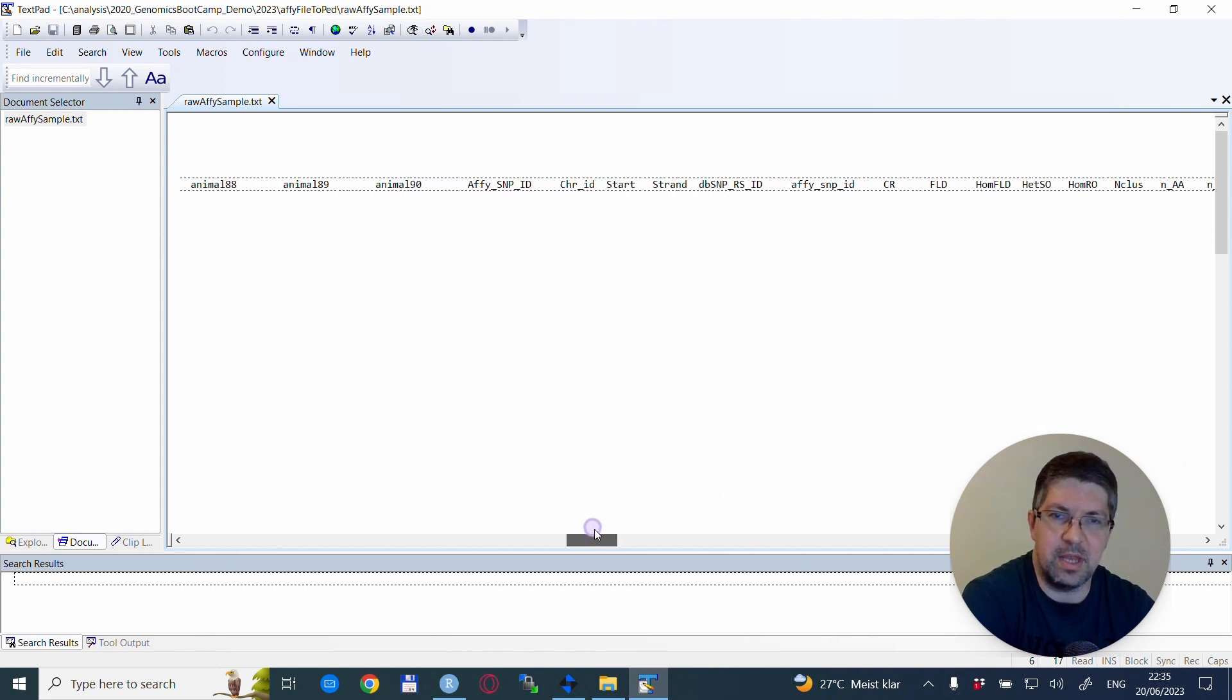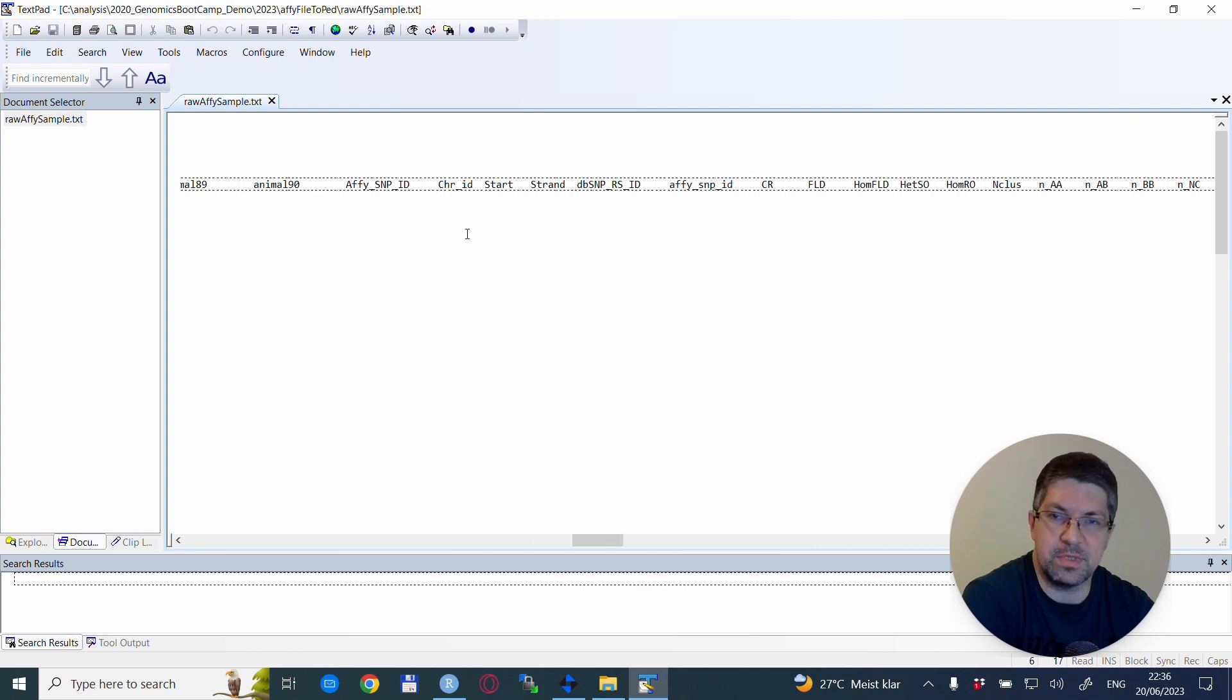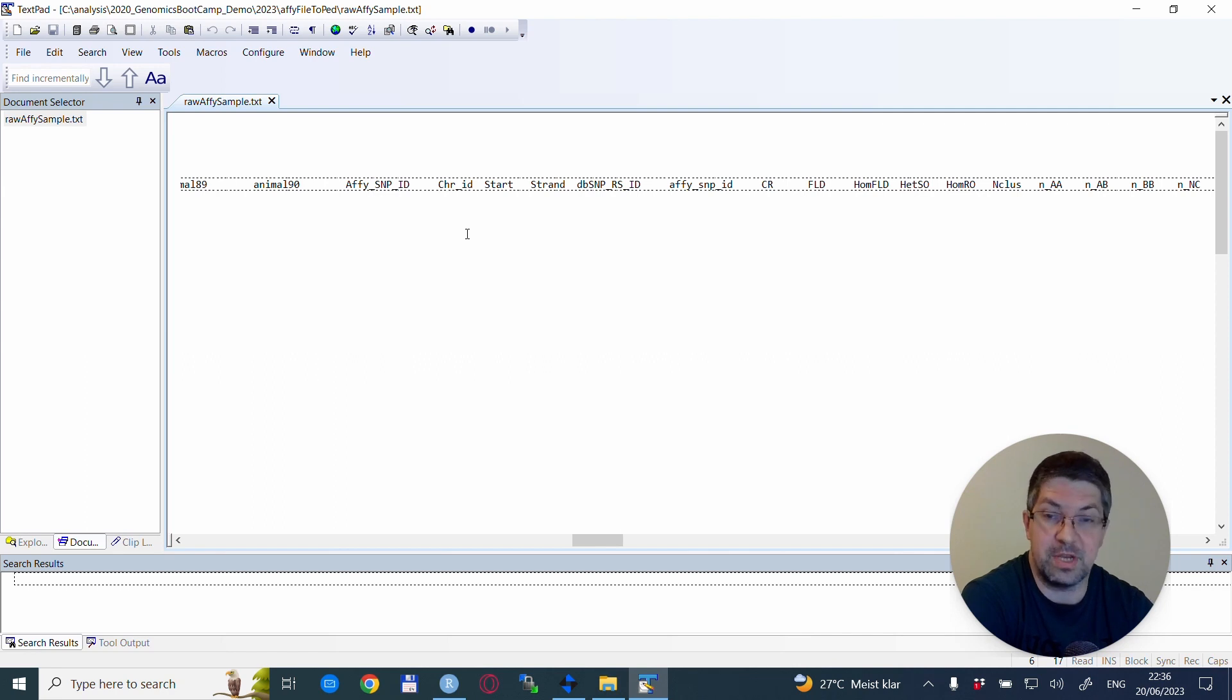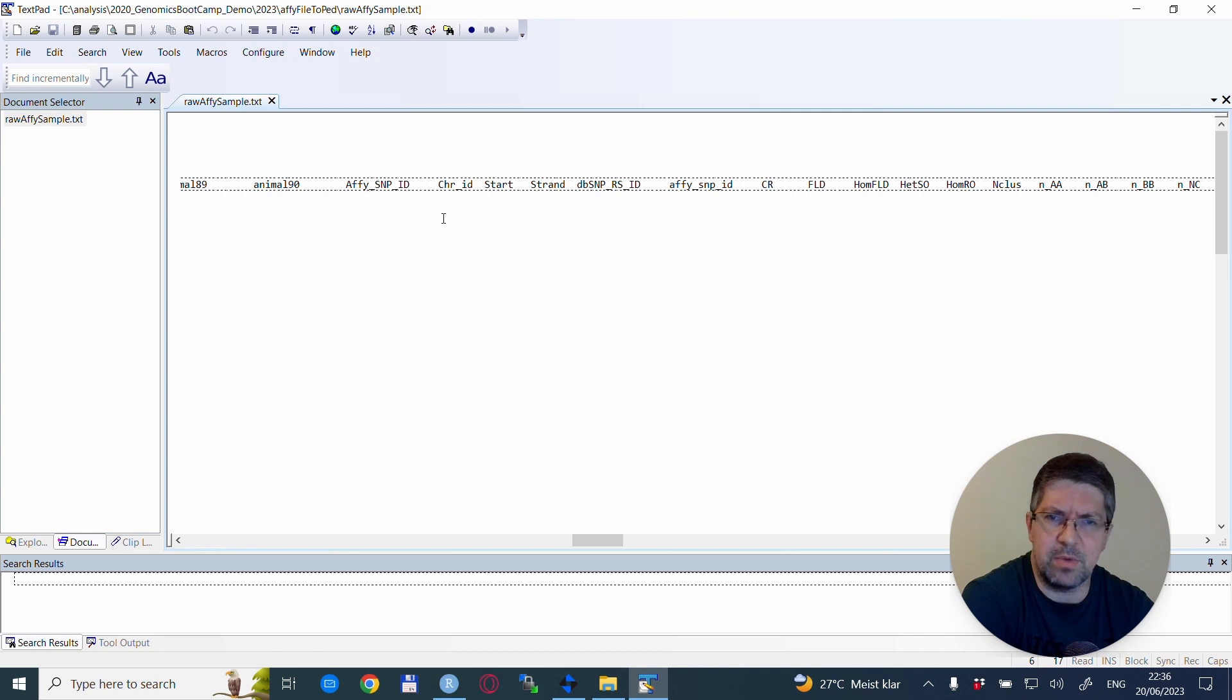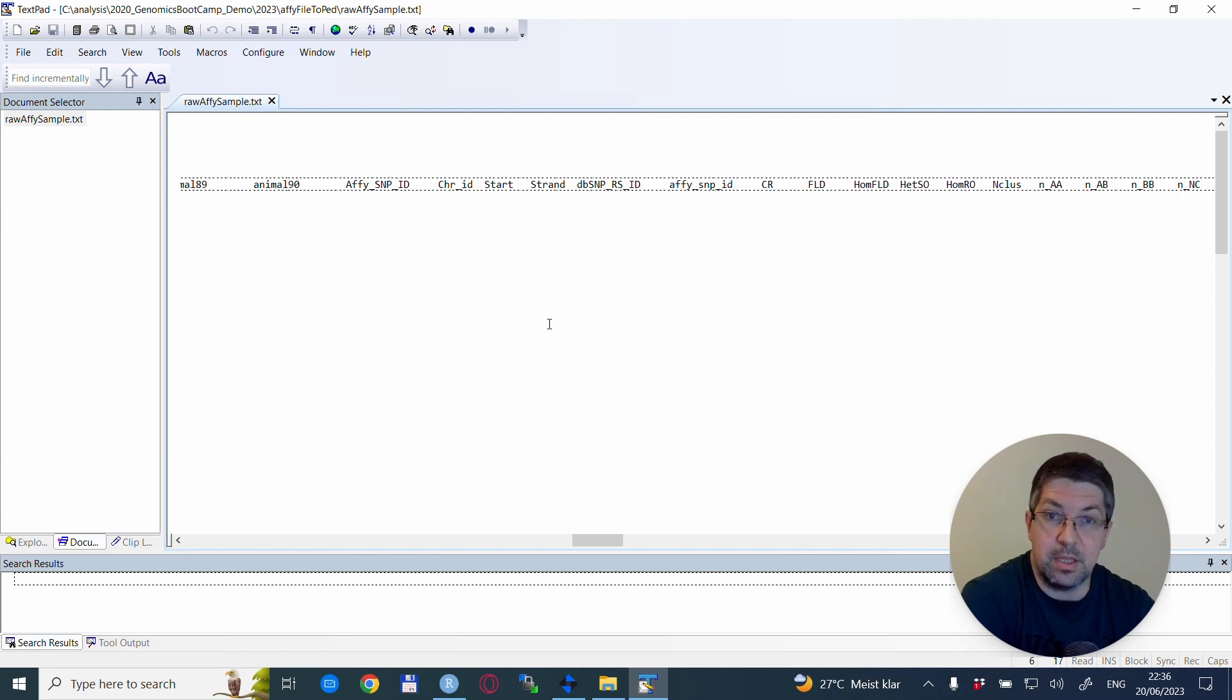There is quite a number of other columns. Some very important columns for us will be the chromosome ID, and the SNP ID is the first column. And then there is also the start, which is the position of the SNP, which will be very important for us.